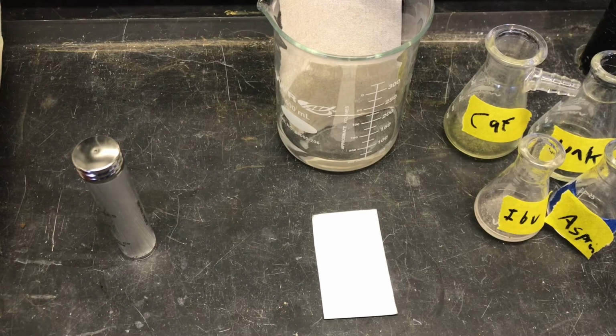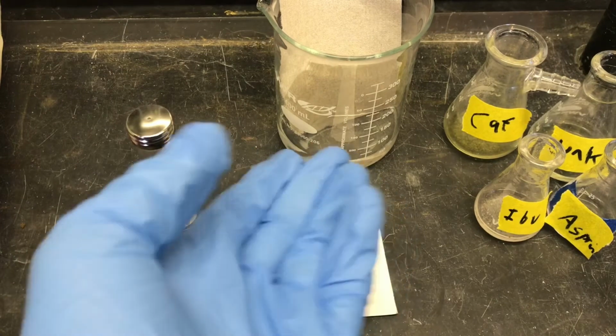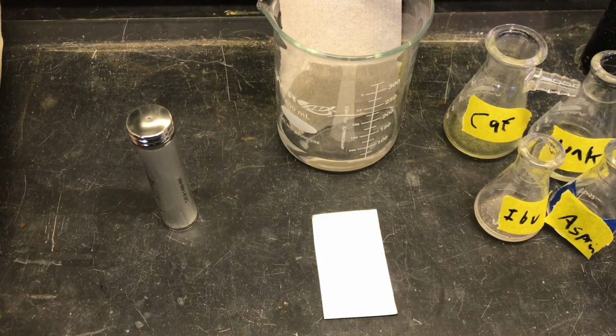To start, what you're going to need: capillary tubes, just your normal glassware, a large beaker especially is good for the mobile phase and stationary phase interactions. In our case, we have 4 different things that we're going to be putting on the plate: the 3 analgesics and then the unknown mixture of analgesics.